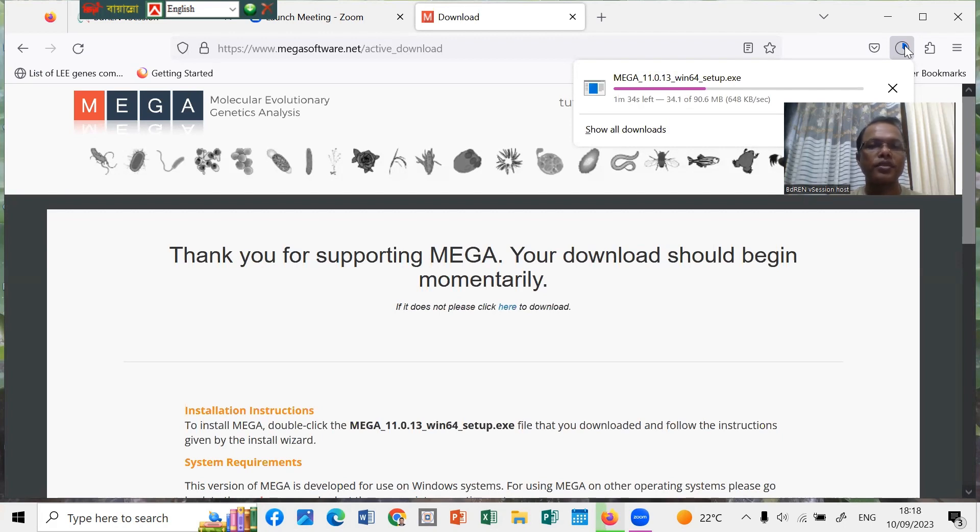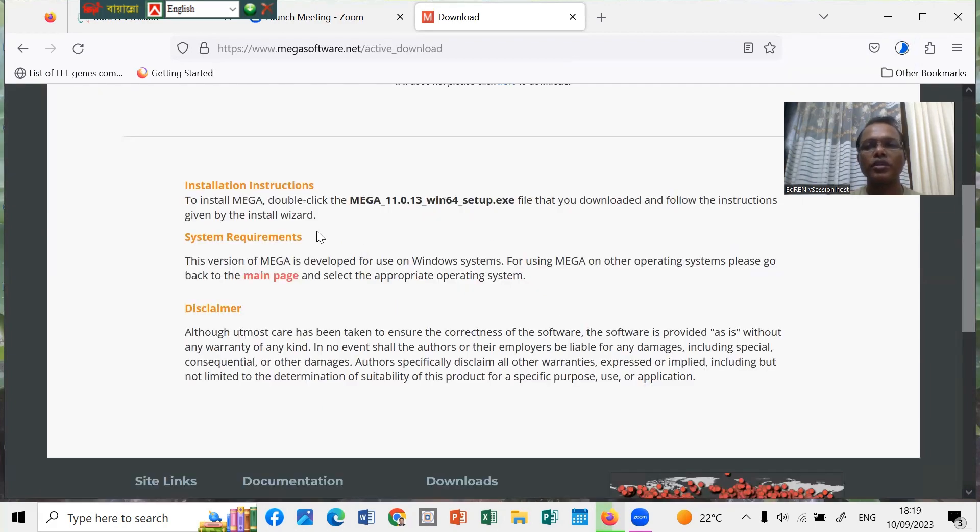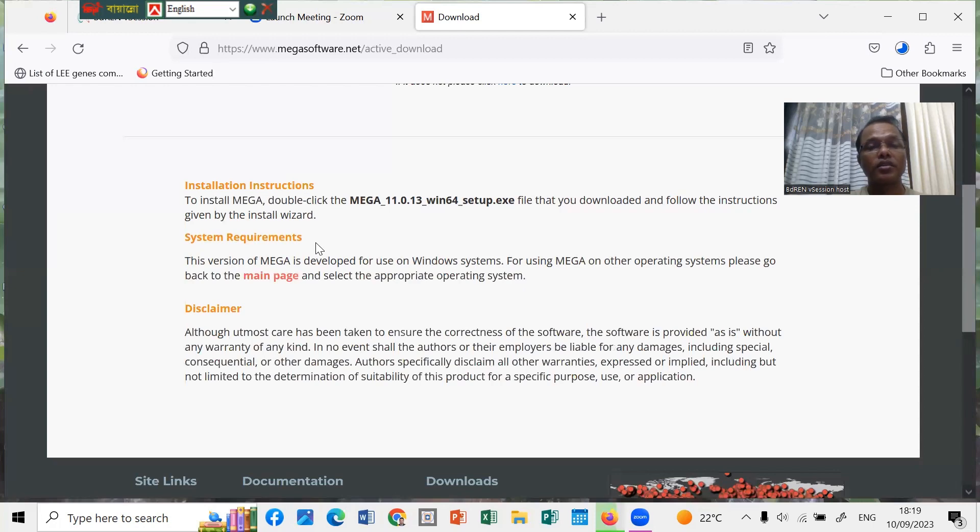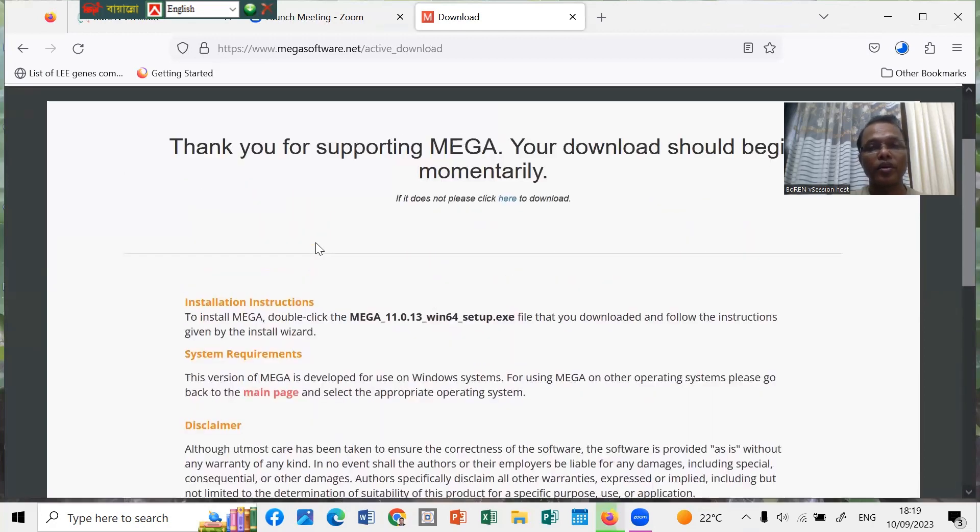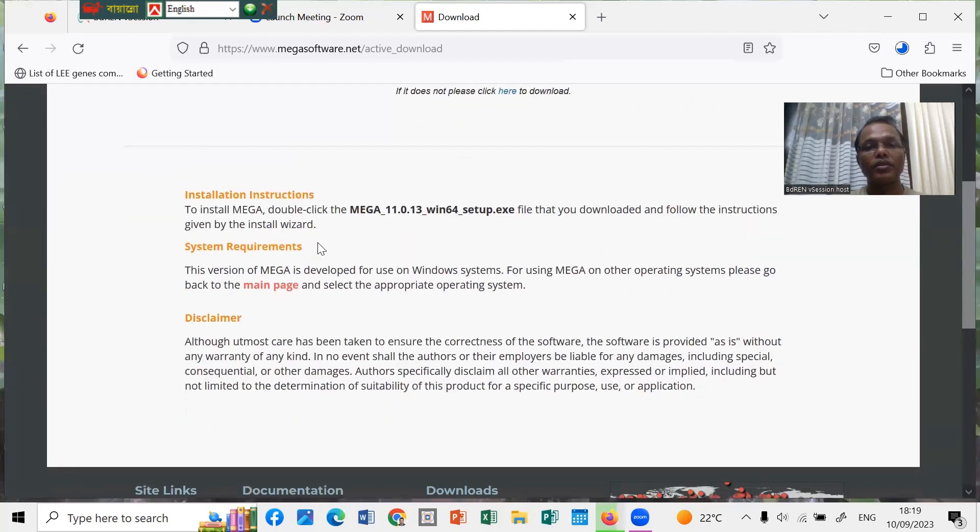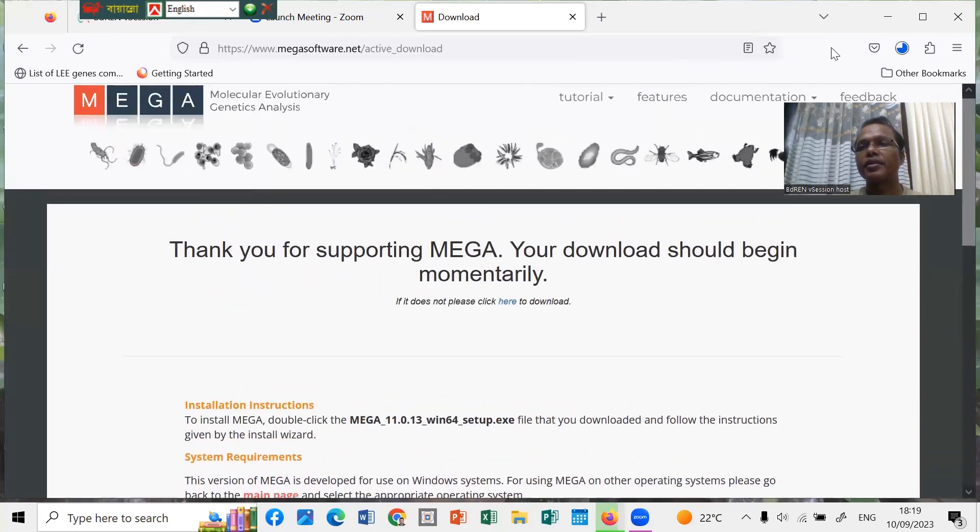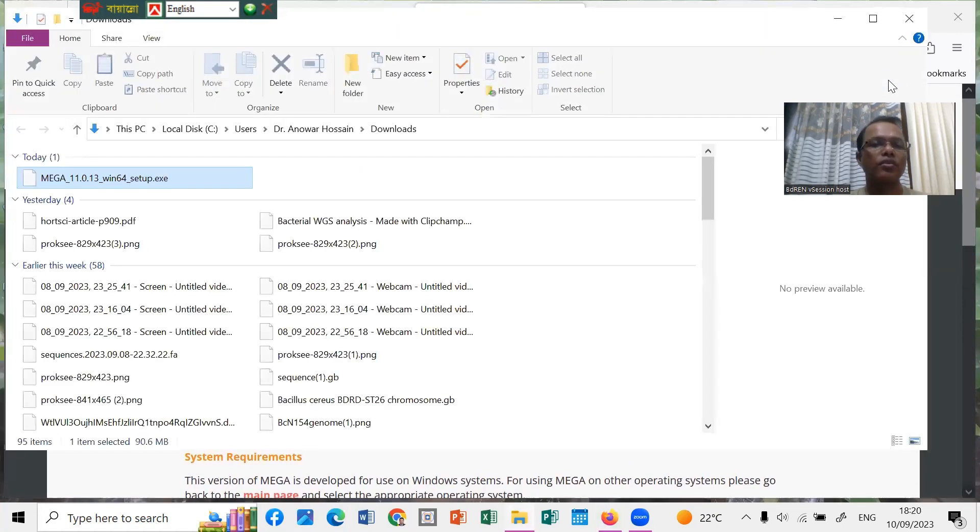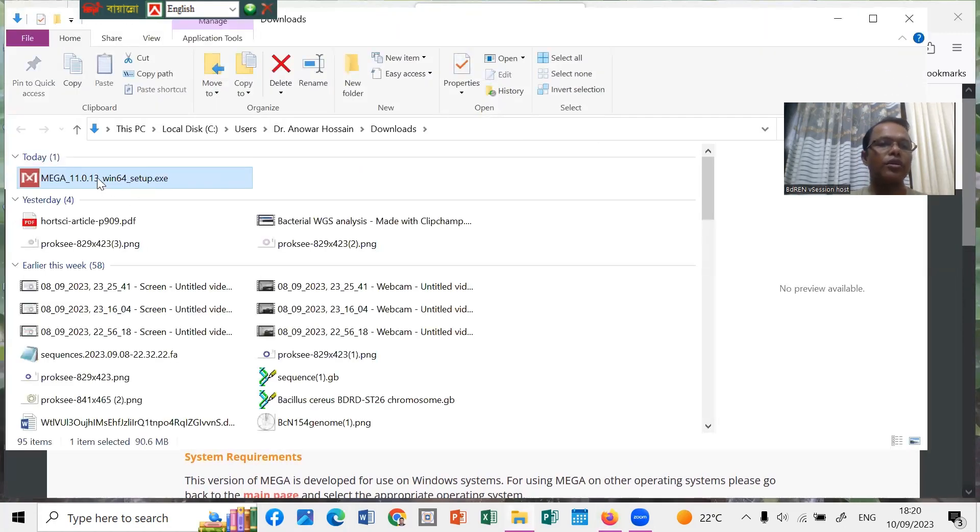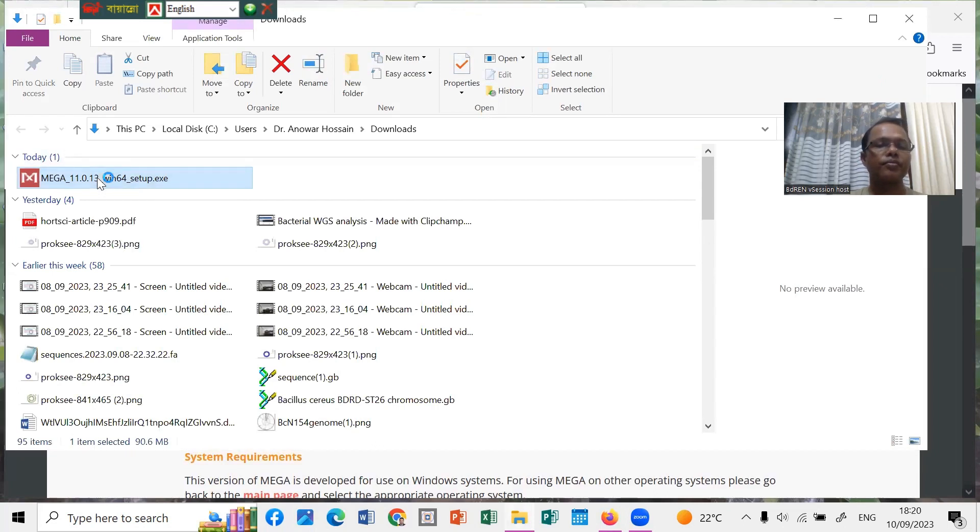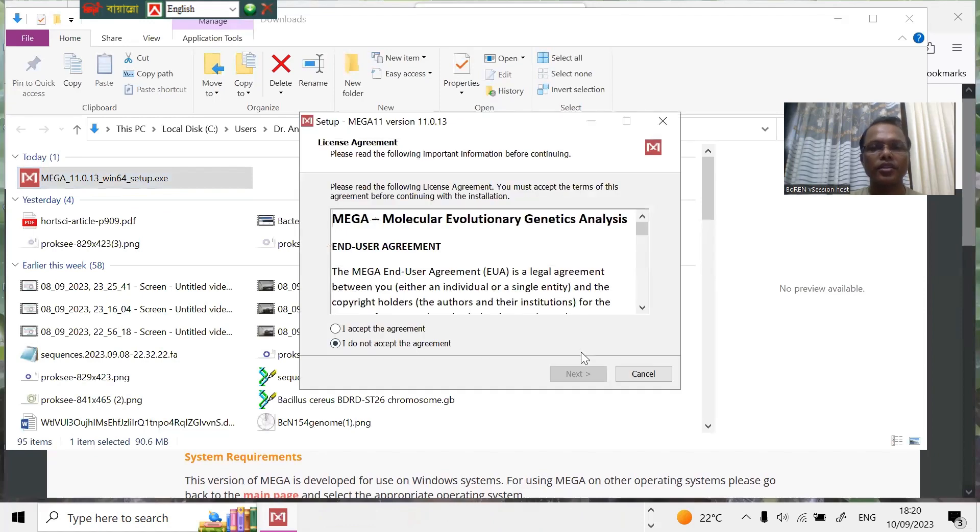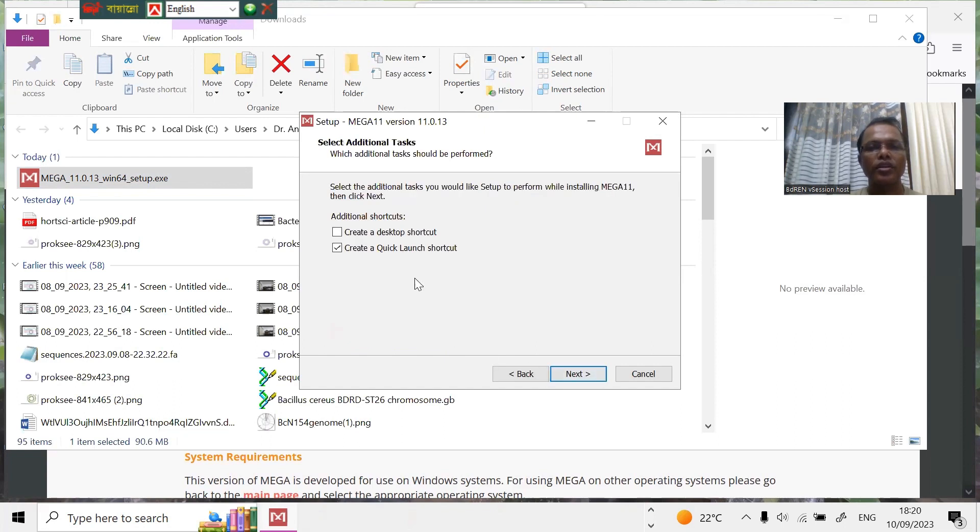For the installation, we have to double-click the MEGA 11 setup .exe file that is already downloaded, and we have to follow the instruction wizard. The system requirements is the Win64 setup. It's working. Now you can double-click. The language is English. I accept, then next. Quick launch shortcut, next, install. It takes time to extract the file and install the software in your computer.